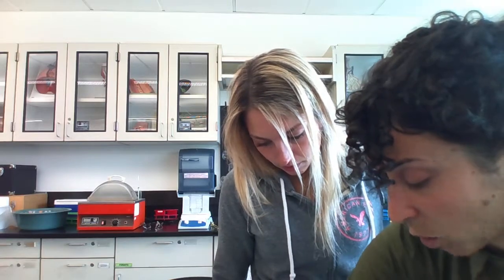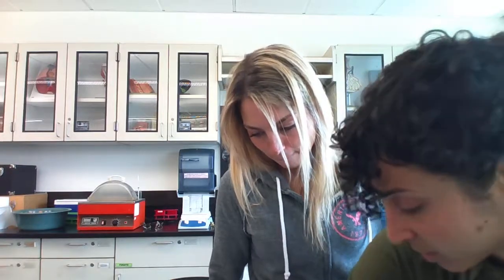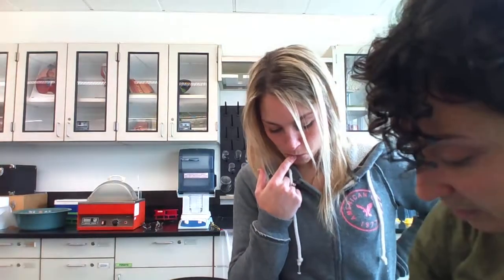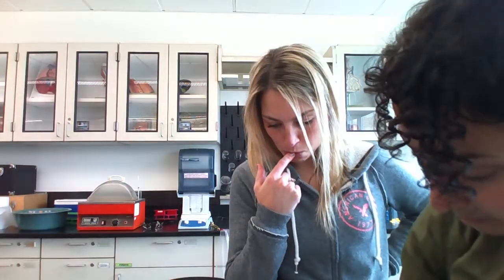Yeah. Okay. And then these are just different, with or without bile and at body temperature or not at body temperature. This one has the as if you ate a bunch of oil, and only lipase is breaking it down in your body. This is not at body temperature, so it's not going to work as well, because your body has the right temperature for all your enzymes to work.